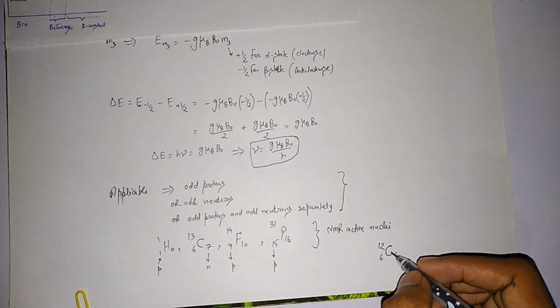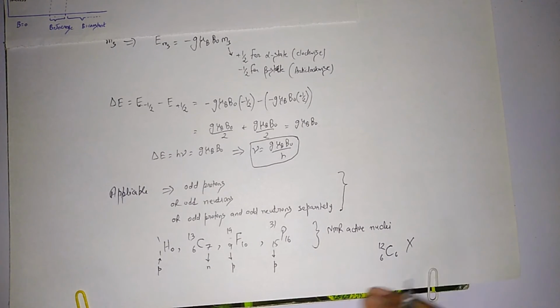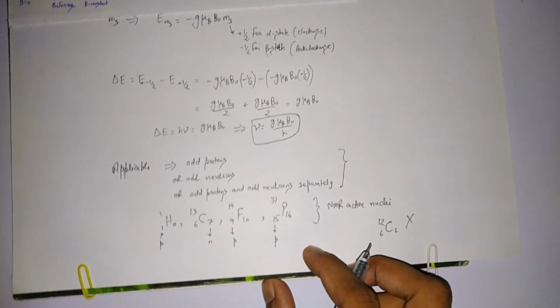That's why this nucleus is NMR inactive.